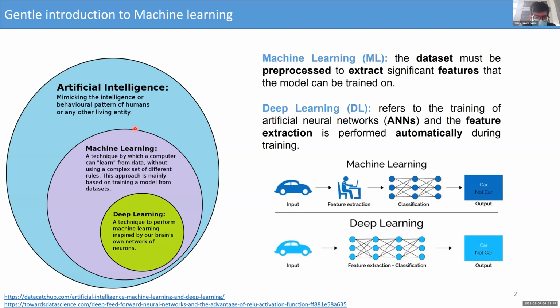The first technique that is often used in material science is machine learning, because machine learning actually works based on past experiences. So if you have any data and if you know what the data corresponds to, you can train a machine to analyze such data. You're the one who's feeding information, telling the machine what it needs to learn from the data, similarly to how humans do logical processing. The same thing does machine learning, whereas deep learning is a subcategory of machine learning where we use these in-depth neural networks.